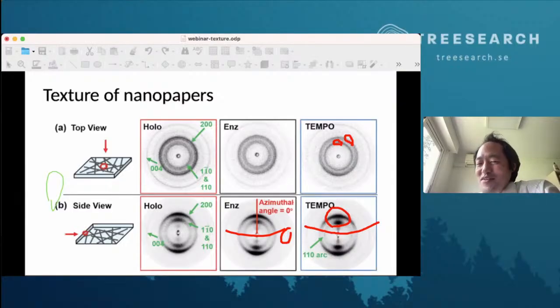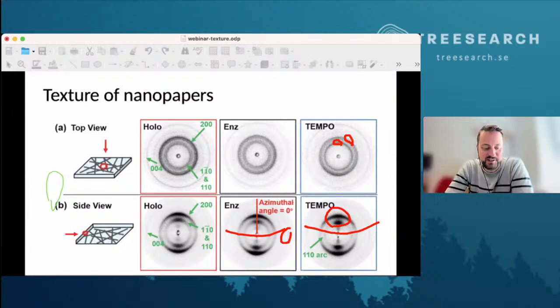No, because what you see, when you have bulk water, is the typical scattering pattern of bulk water. X-ray does not distinguish any chemistry. We are looking only at the electron density fluctuation. So if you don't have this typical structure, then you don't see it. It is only valid if you are drying from a very wet cake to a roughly dry condition where you lose bulk water. I'm not saying that the last 5% we can detect by scattering, because then the structure would be different, of course. Okay, that was a pity.